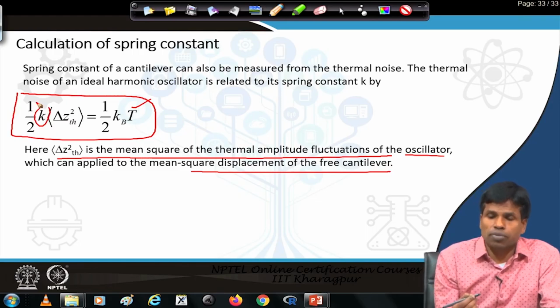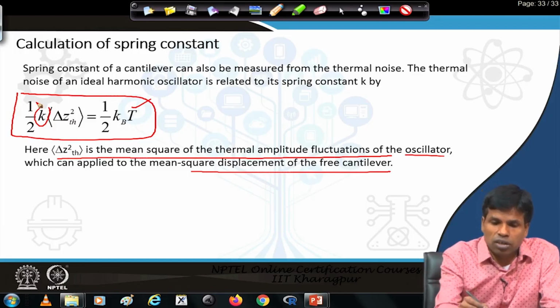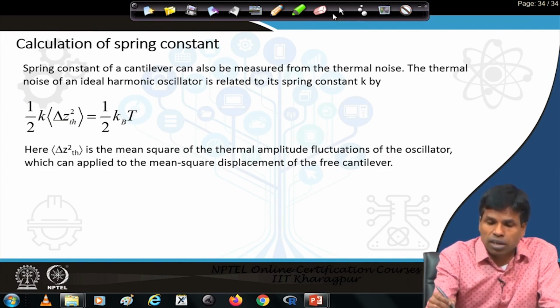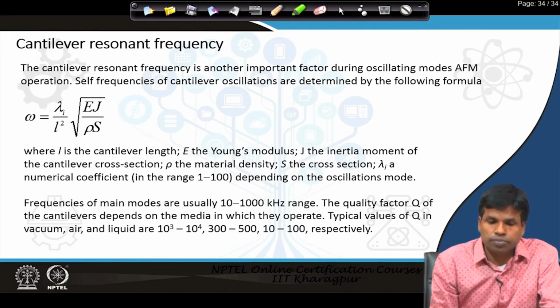There are other methods also available to calculate the spring constant, which I am not discussing here, but these are a couple of methods which are quite easy and quite extensively used to estimate the spring constant of the cantilever.